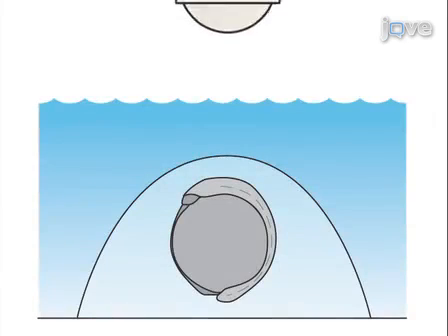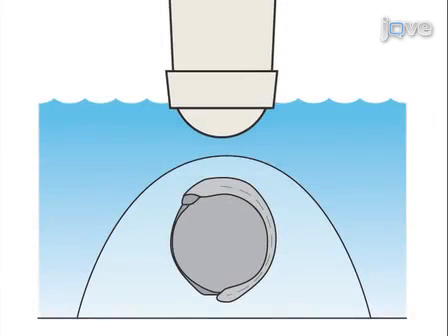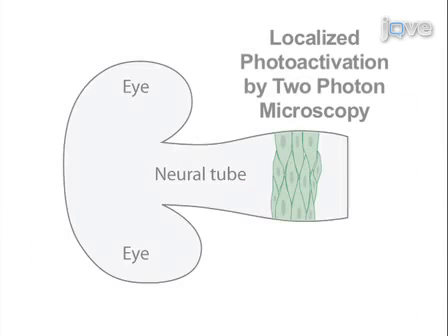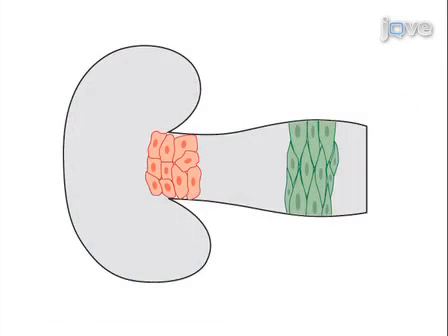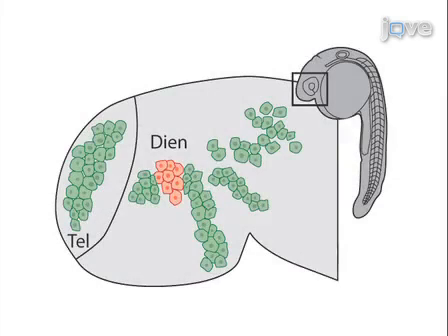As a second step, embryos are grown and mounted in a low melting point agarose, which immobilizes the live embryo. Next, two-photon microscopy is used in order to localize a visible fluorescence transgenic landmark. The light-responsive agent is then activated in a desired focal plane, and the extent of photoactivation is monitored. The fate of the resulting labeled cells can then be traced at later embryonic stages. This procedure can be utilized for the activation of a variety of compounds at a single-cell resolution in live specimens.